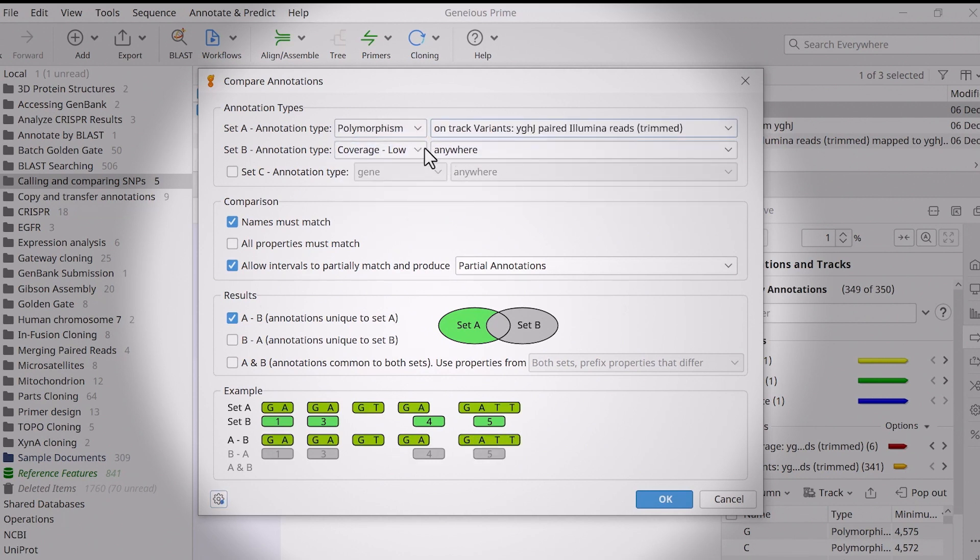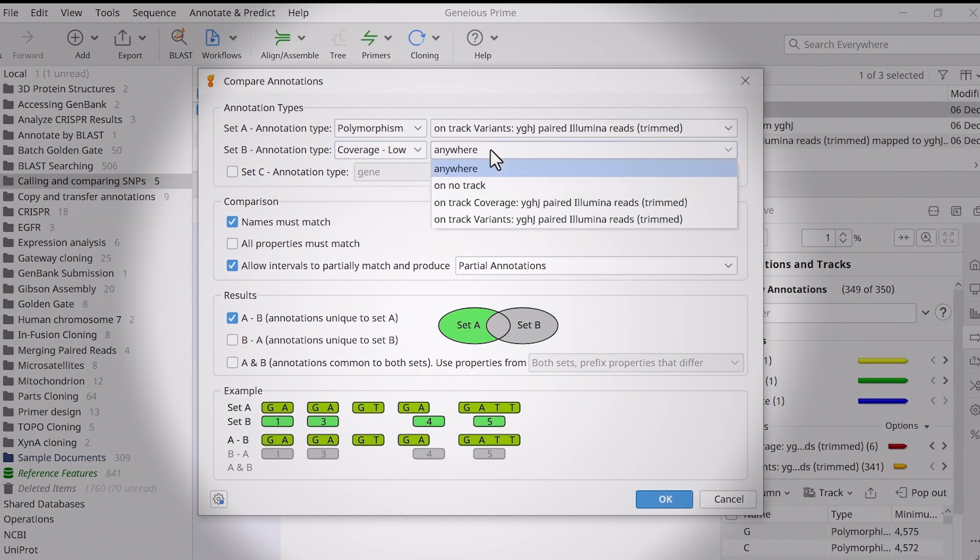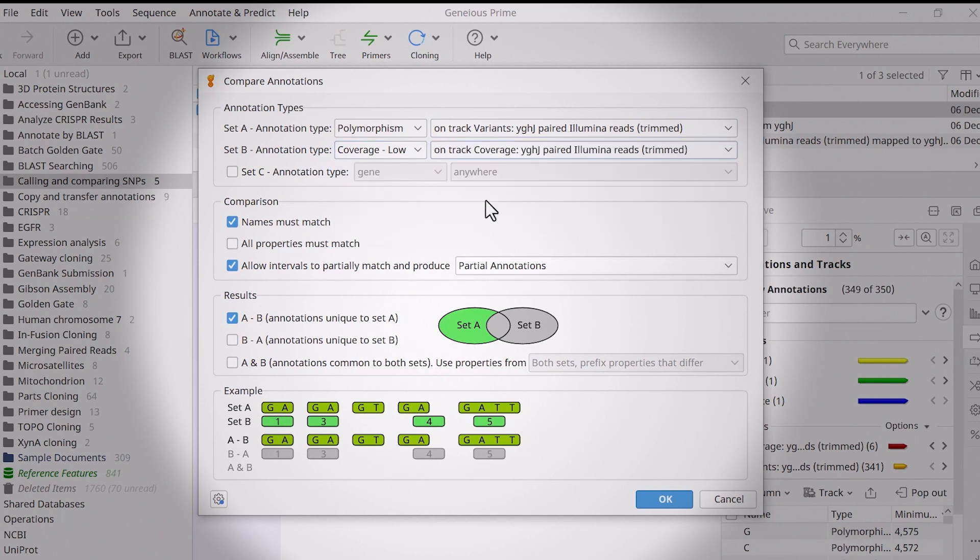Track B will be a low coverage type on the coverage track. Under Comparisons, uncheck the requirement that the annotation names match.